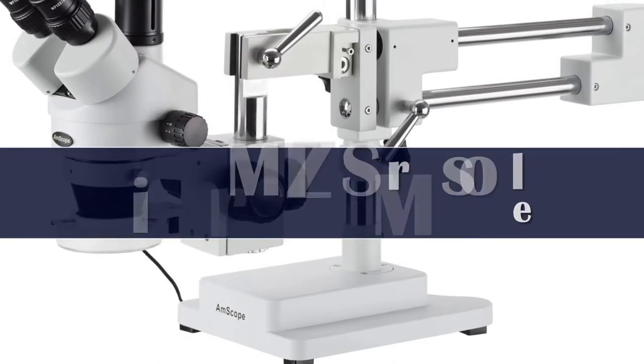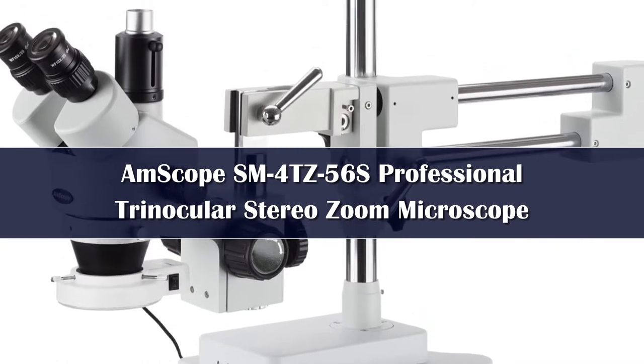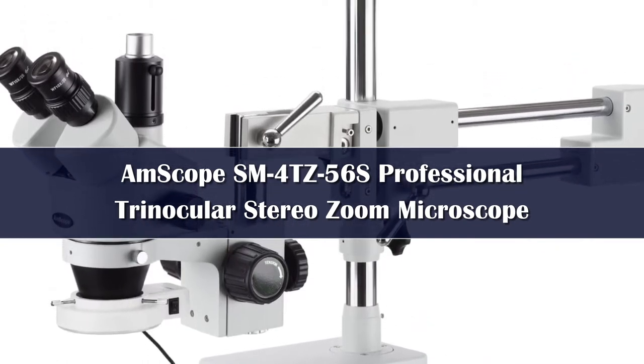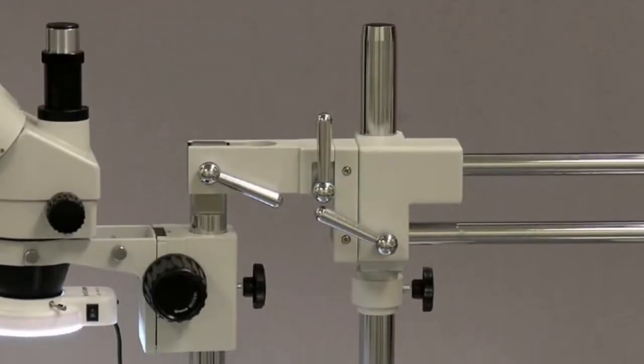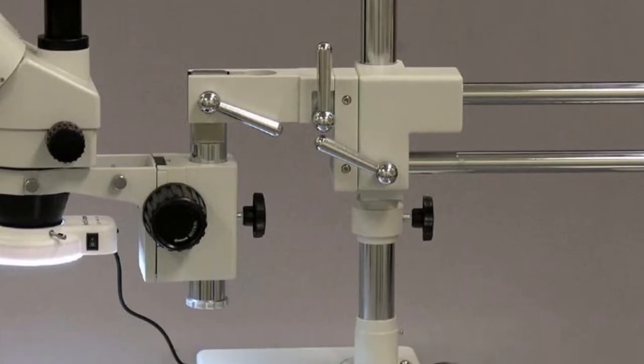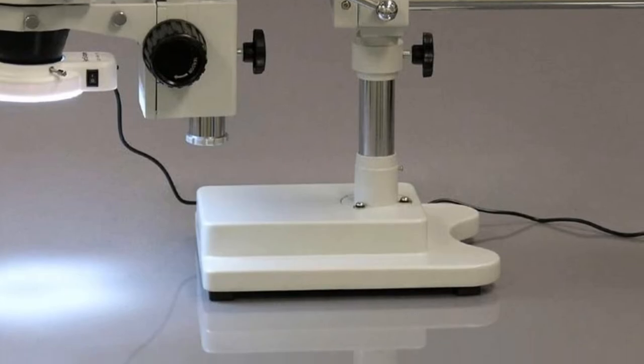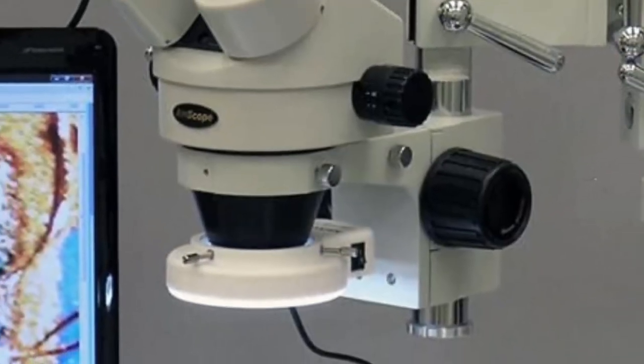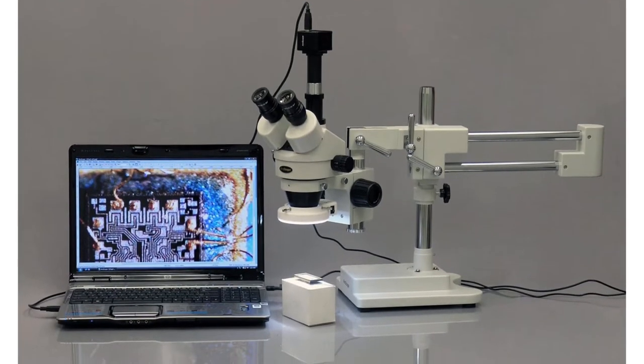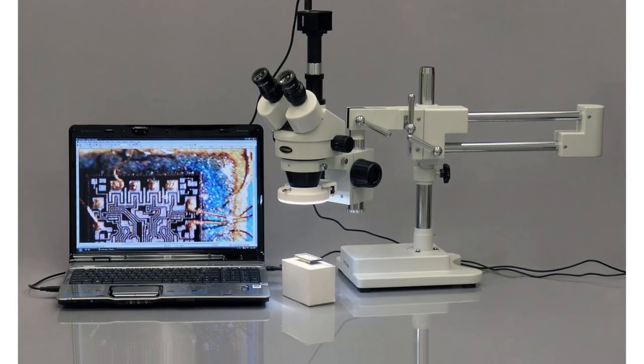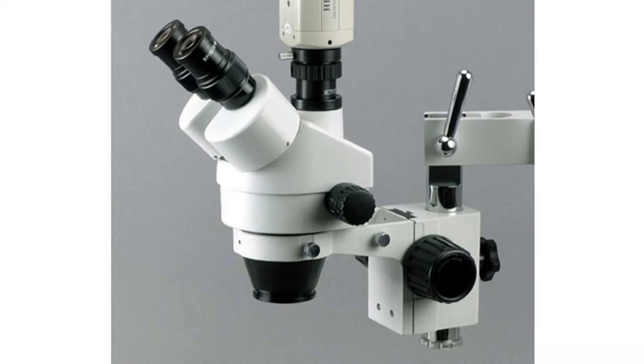Number 4. As we mentioned, trinocular models are the best stereo microscopes with camera options. If you want to record your experiment or workflow, something like this version from Amscope is an excellent choice. This professional grade microscope is perfect for all kinds of activities. Sometimes you want to be able to zoom into your target from a wider field of view. Some microscopes make it tricky to do this, while the SM4TZ56S does it all in one fluid motion.